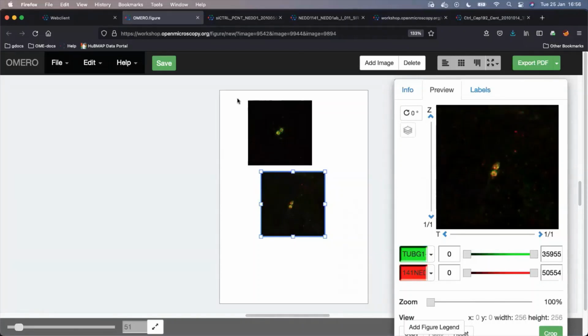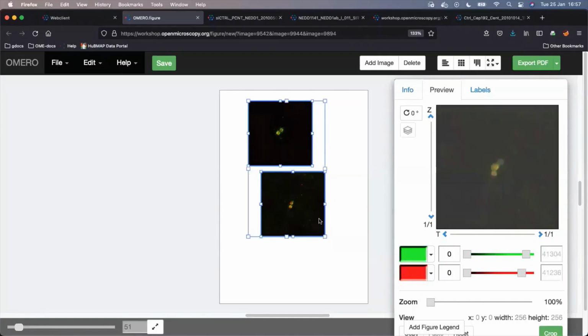The application is basically based on having a lightweight recipe where I put the images on a canvas, and they are adjusted as I see fit on the basis of OMERO.figure asking OMERO about the metadata and the other parameters I'm changing here.